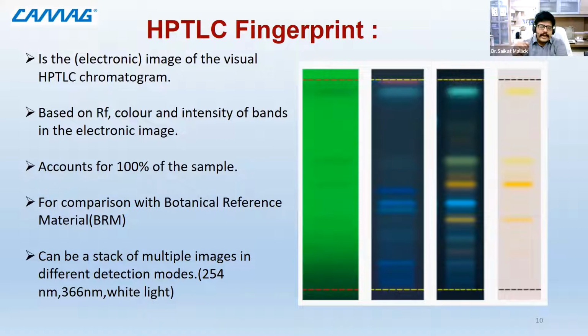So at a time, if I have this plate dipped in, say, a microbial solution, maybe Staphylococcus and things like that, immediately the components which are reacting with that Staphylococcus bacteria I can easily identify, and at a time I'm screening many fractions or many compounds that are present in that sample. And further, suppose this blue color sample is showing an activity, what I can do is just isolate it and perform a 2D to see if the molecule is single or if it is a mixture. And then from that you can go for further estimation. That same 2D plate you can also use for bioautography studies.